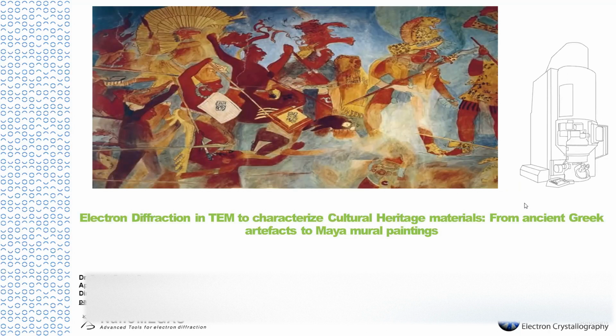As Nikos said, I started my scientific career with X-ray diffraction, and for the last 8 years, I have been working on applying transmission electron microscopy for materials characterization and also developing new methods in this area. In the last 2-3 years, we got interested to apply transmission electron microscopy to characterize cultural heritage materials. And in this presentation, I will show some of our work over the last few years.